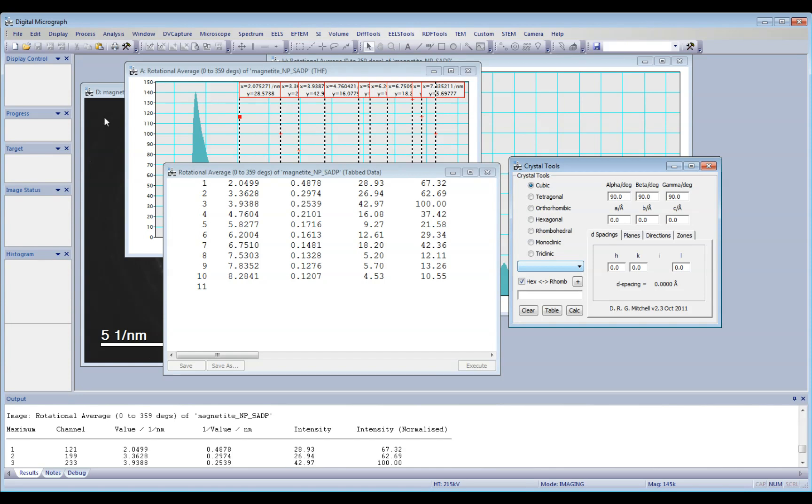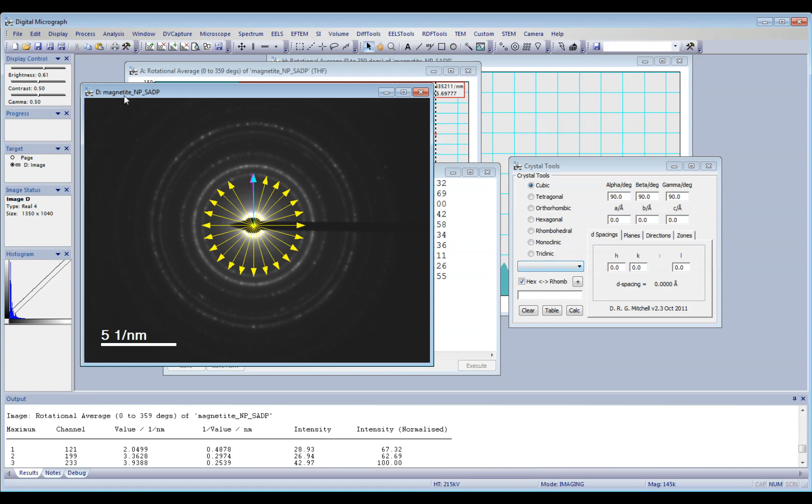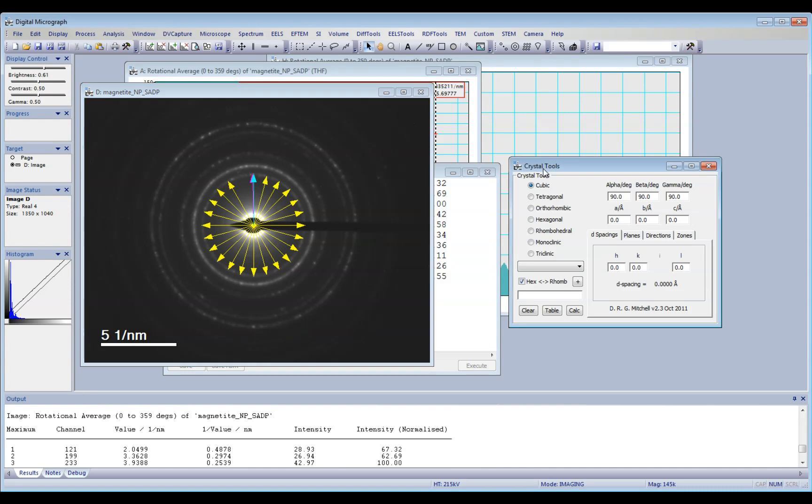So in my case, I got an electron diffraction pattern, a selected area diffraction pattern of magnetite nanoparticles. So I also have included magnetite down here on my list.